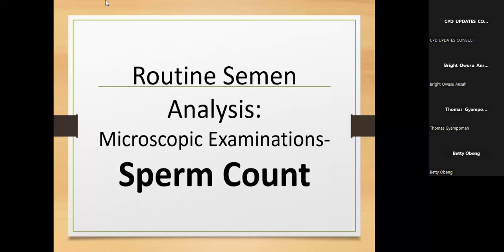We're going to do sperm count. So we've done a lot of the microscopy work. We finished with the microscopy: we're done with motility, morphology, aggregation, agglutination, and so forth. We've done all that we have to do. Then another important point is the sperm count. I'm going to try to introduce to you something unique, something new with the sperm count.